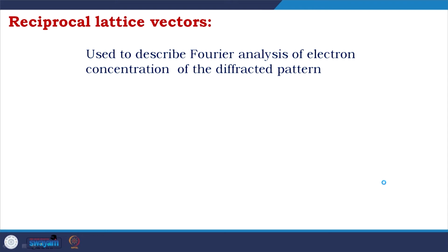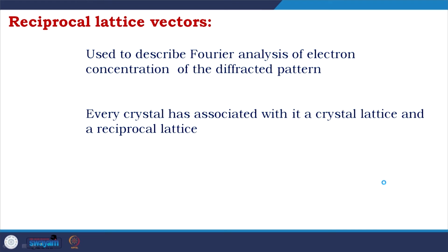So, coming to what I was talking about, reciprocal lattice vectors are used to describe the Fourier analysis of electron concentration of the diffracted pattern. We will talk about the Fourier analysis later. Every crystal has associated with it a crystal lattice and a reciprocal lattice.